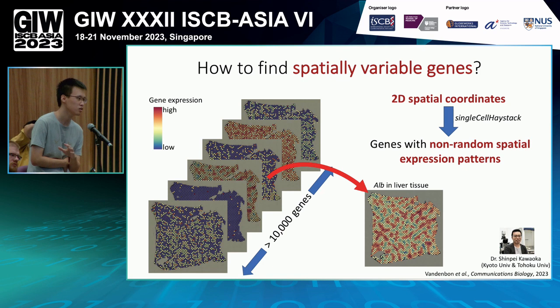Yes, I know you can use any input space, but imagine I have this condition. I have single cell spatial transcriptomics data, which means we could use spatial transcriptomics at the single cell level. So I implemented this on the data in two ways. First, I use PCA to do the process, and then I use the coordinates. I wonder if, with the same data using two different input spaces, we can get the same results of differentially expressed genes.